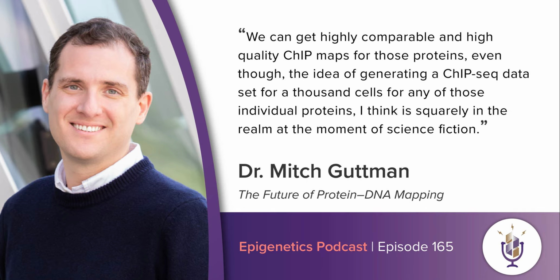And that's something that we spent a lot of time worrying about, exploring and really trying to address and resolve. And maybe in the interest of shortcutting a lot of the work we did on those fronts, what we found is that that's not the case. Even if we include antibodies in our pools that either don't perform well or have high levels of background binding, yes, it leads to the inability to map that protein with that antibody, but it doesn't impact the quality of all the other data and all the other antibodies in the pool.